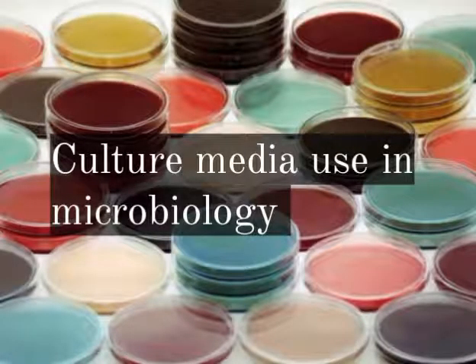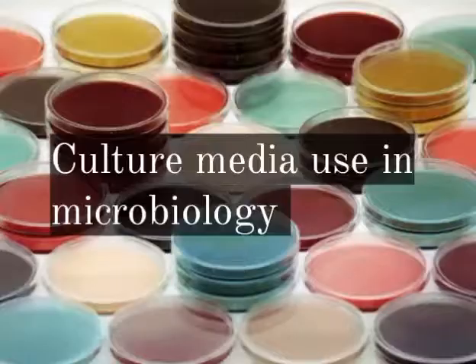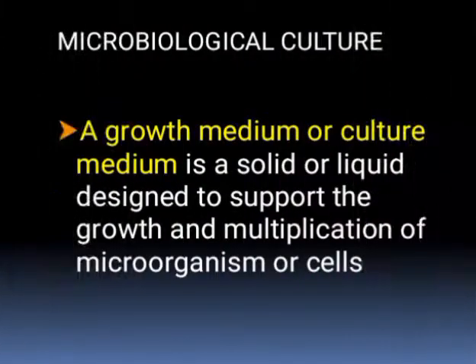Today, we will discuss a very important topic, and that is culture media use in microbiology. What is culture medium? A growth medium or culture medium is a solid or liquid designed to support the growth and multiplication of microorganisms or cells.